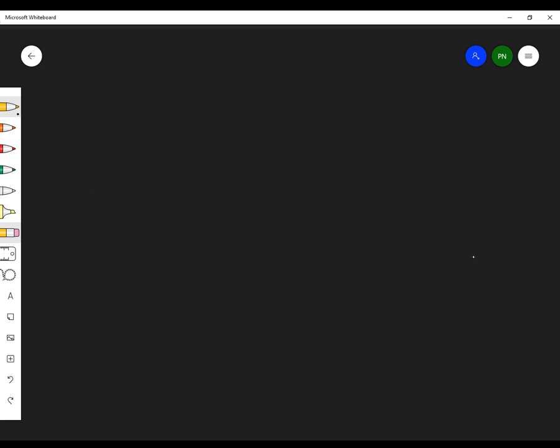Now, we're going to look at the possibility of there being halogens in the compound. We've done the m+1 peak, and this is because of the carbon-13. But now, because of a trick of nature, chlorine, my friend chlorine, comes in 2 flavors.